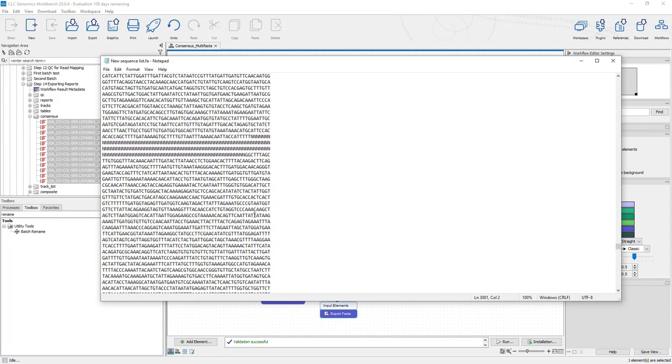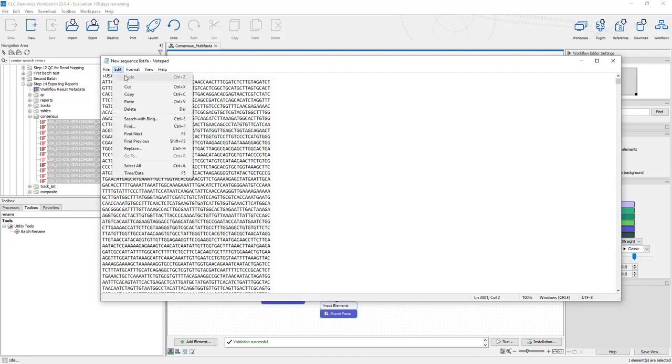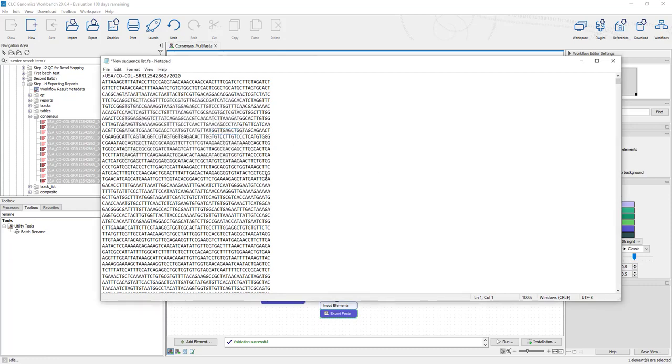Now the trick that I was talking about for submission is just as simple as find and replace, where we want to replace every underscore with a slash, replace all, and now it's in the format, say, the spheres format. And that's how you create your exported concatenated FASTA file, at the same time screening it on metadata for the pass-fail.